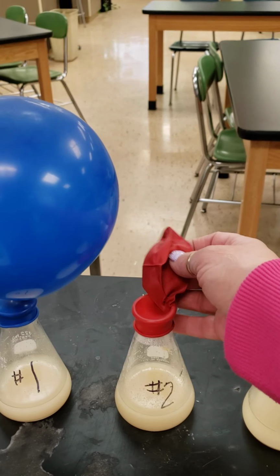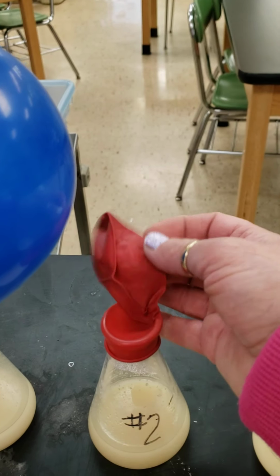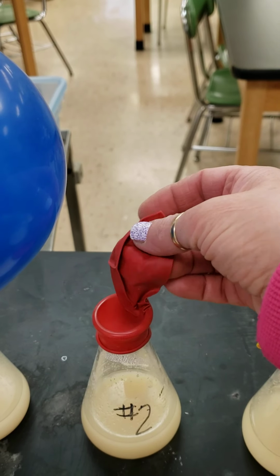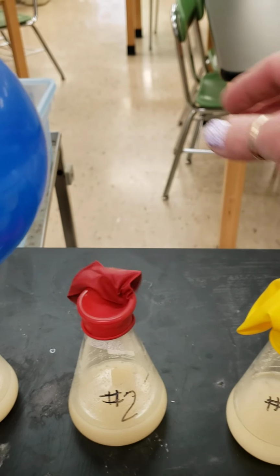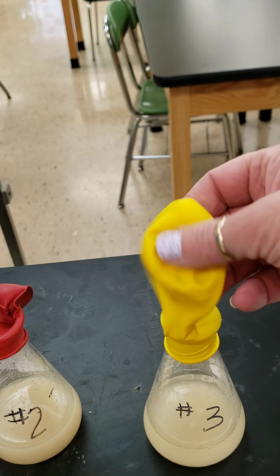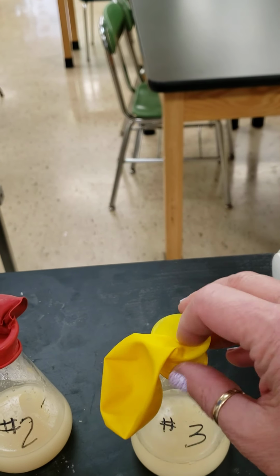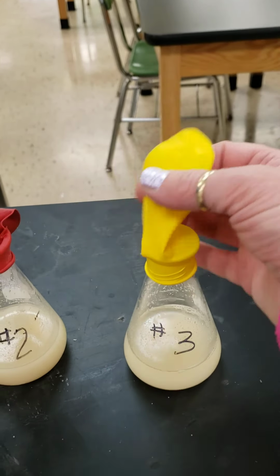If you look at flask number 2, the balloon is almost sucked into the flask, and any air that was in there to begin with is sucked out. Flask number 3 has a little bit of gas in the balloon. It's not sucked in, but it didn't produce a lot of gas. Not a lot, just maybe a little.